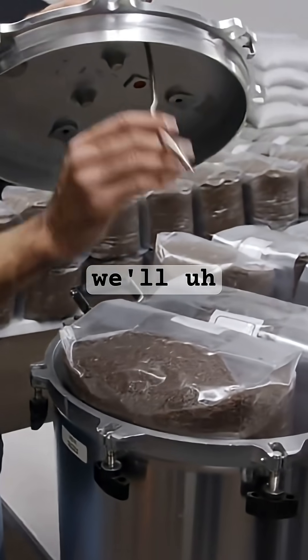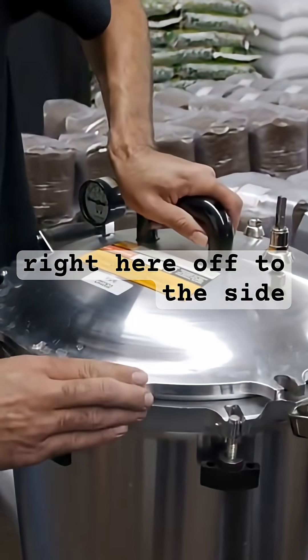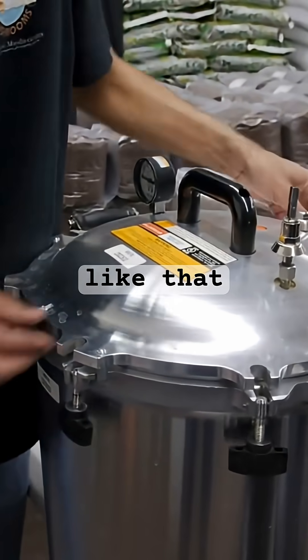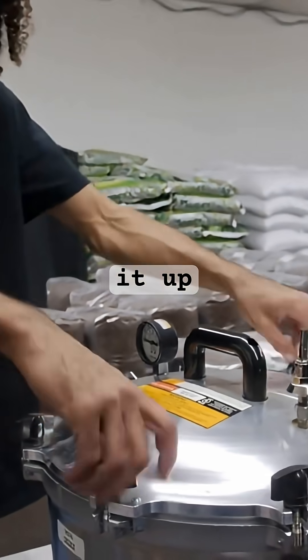We'll grab our lid, put this cord right here off to the side, then we'll just lock it up like that. Spaces around here are all even, and we'll just tighten it up.